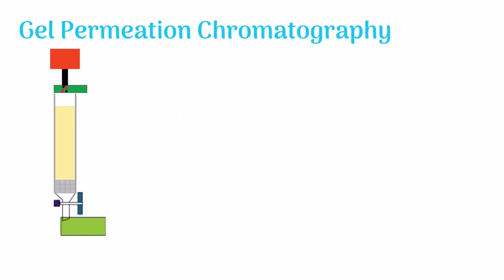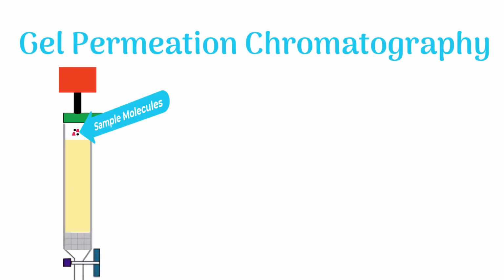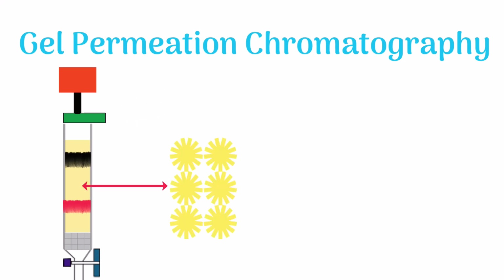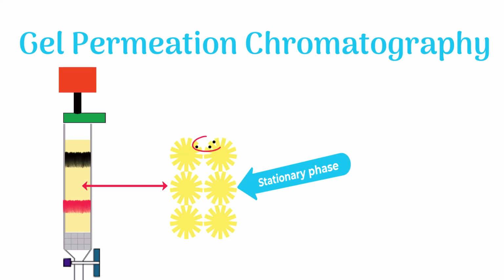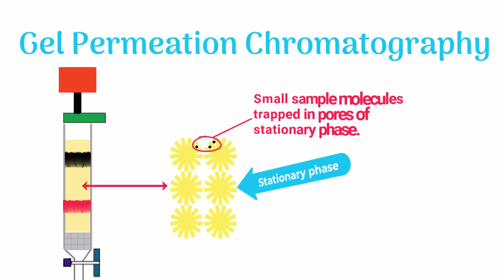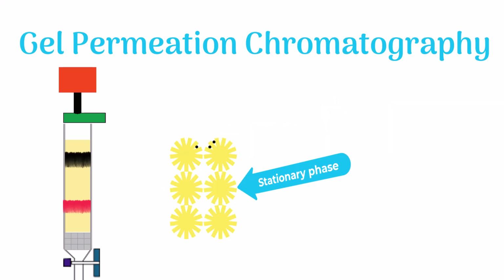When the sample reaches the column, the sample molecules get separated. Let's see how this happens inside the column. When the small sample molecules pass through the stationary phase, they get trapped in the pores of the stationary phase. Therefore, they move slowly and escape later.